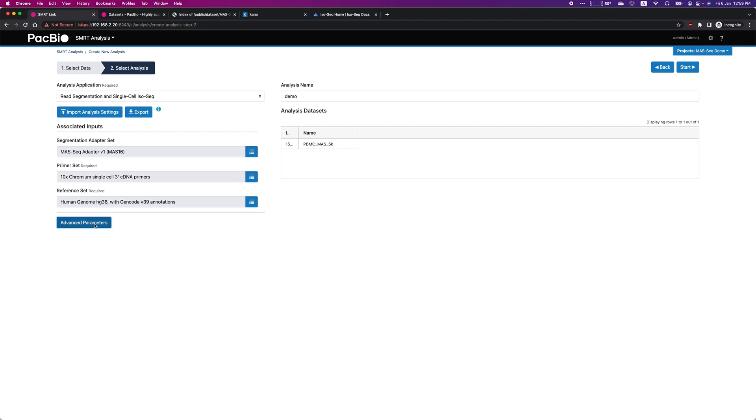Other than that, in advanced parameters, you can also choose custom barcodes and UMI design.